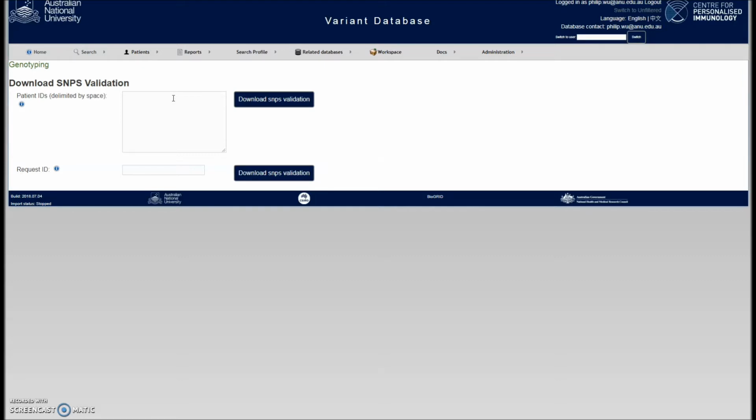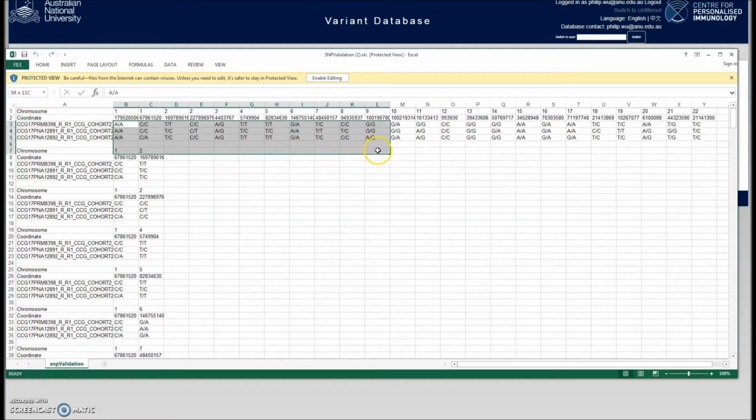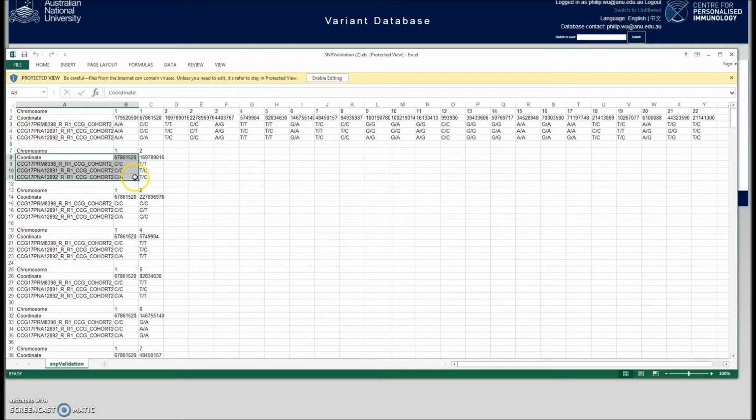At the top we can see our SNP panel with individuals going down the rows and their expected genotypes going across with the genomic positions. Further down we've compiled a combination of SNPs for each individual to uniquely identify them. And in this example we only need a maximum of 2 SNPs per individual. As batches get larger, determining which minimal set of SNPs to be used can be time consuming and error prone, so we've automated this step for our technicians.